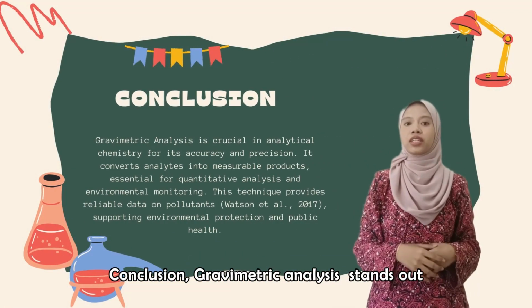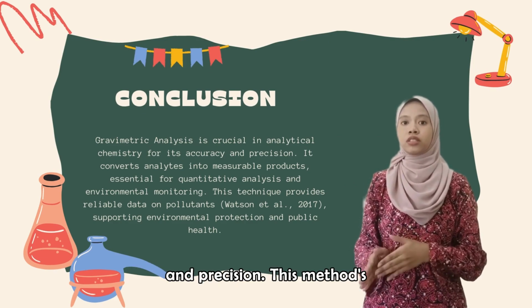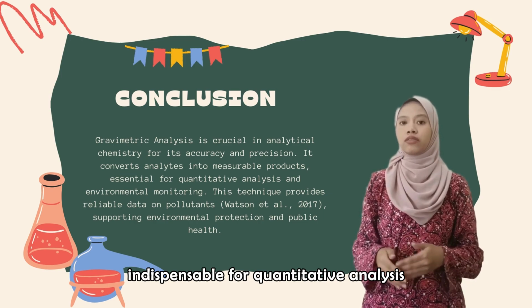Conclusions. Gravimetric analysis stands out as a fundamental technique in analytical chemistry due to its exceptional accuracy and precision. So this method's ability to convert analytes into measurable products makes it indispensable for quantitative analysis.